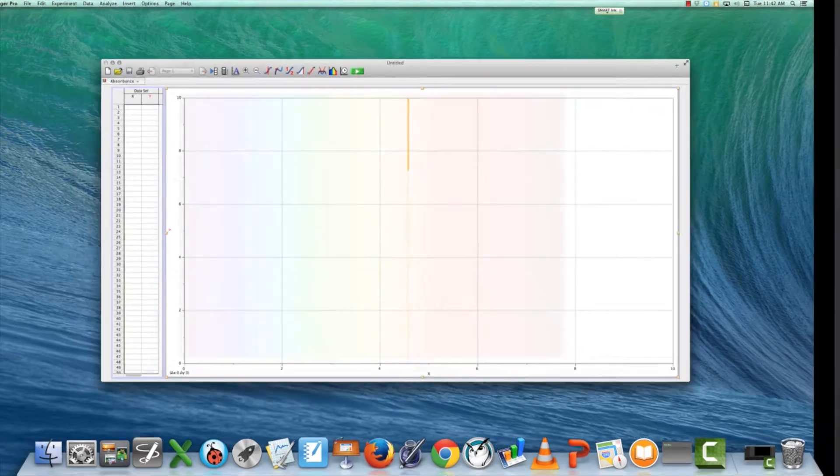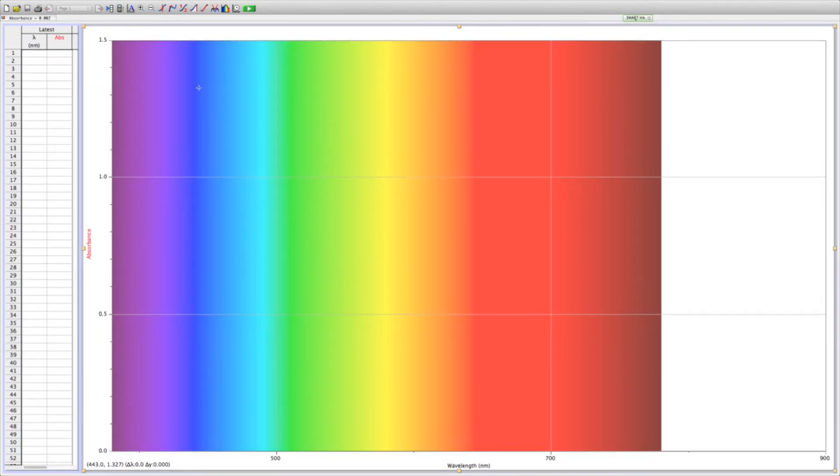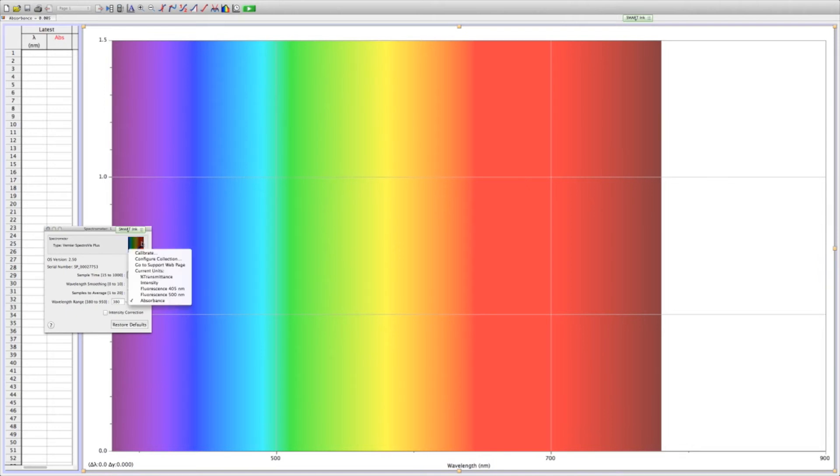In the upper left-hand corner of the screen, you will find the word absorbance with a picture of a rainbow in a box. A text box will pop up with another rainbow box. Click on it. On the drop-down menu, click Calibrate.